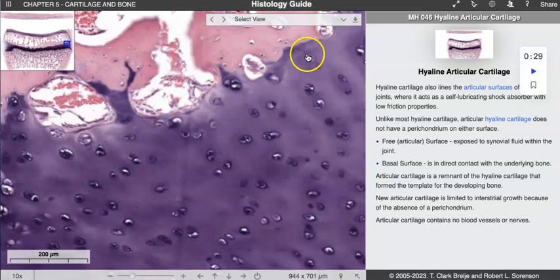This is pretty further into development, but at the border between, let's say, the resting cartilage and then the bone developing at the epiphysis, you might be able to see some of those chondroblasts here. As you get more towards the center, they really don't exist. Even the resting cartilage almost completely dissipates. So we can talk about that with growth and development.